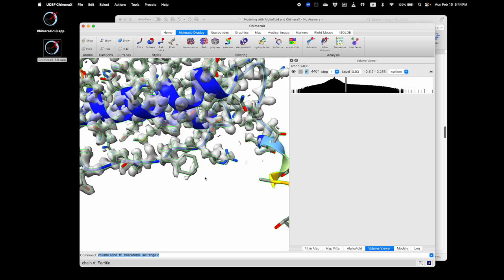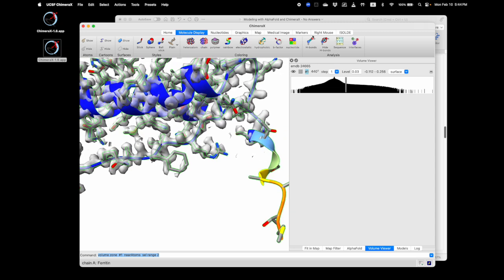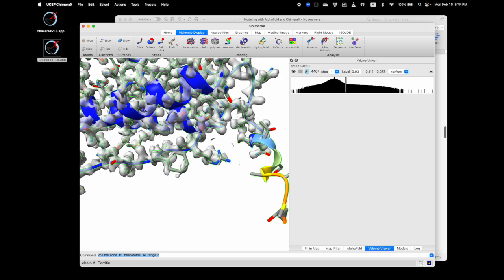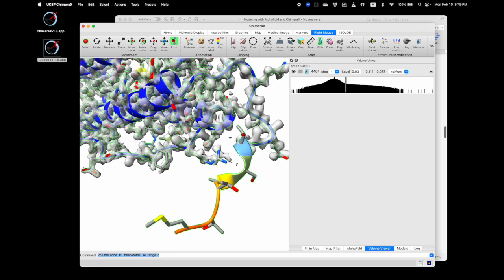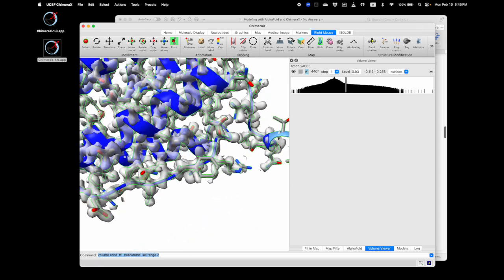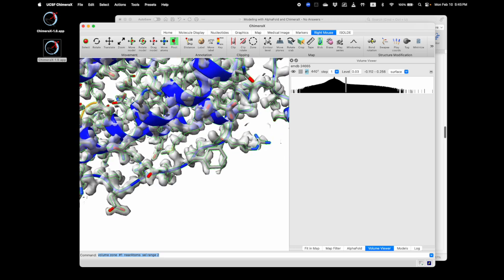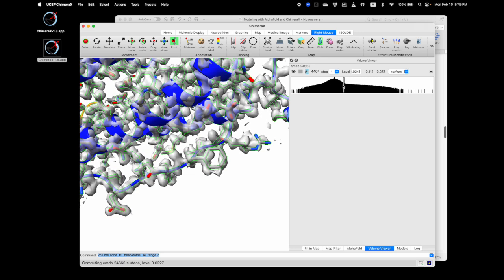And here I have my middle mouse button, you'll notice it is focusing on a particular point, or sets the pivot. So this is something useful for navigating. If you don't have a middle mouse button, you can use right mouse mode pivot, and this will do the same thing. So it will change the pivot point to something that you click on, and that can be very useful for navigating.